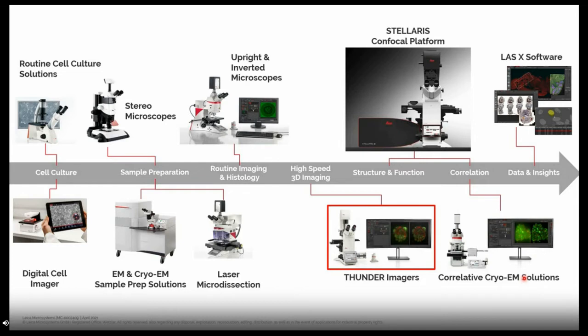Across many of these products, we have a software suite that is supported on all of them called LAS X. This is so that when you switch between products, you're not switching your user interface, you're keeping it very streamlined in the same user interface. So with these products, we want to really be able to support the researcher in a very broad sample type.